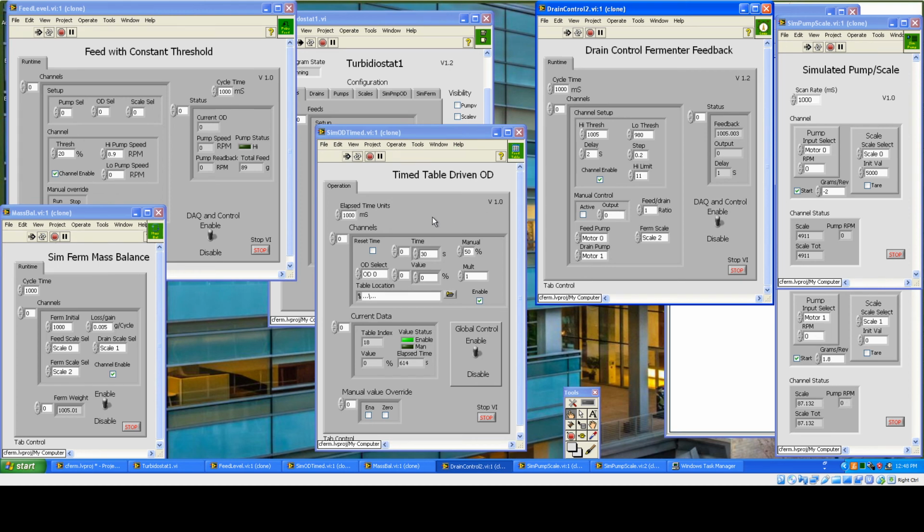We're no longer driving the OD sensor. Well, what we've shown is that when the OD sensor is running, we can regulate. When it's off, we regulate as well. Judicious selection of the high limit here and some of the speeds involved obviously affect the amount of oscillation we're going to get in the volume or weight, which is what we're really regulating on.